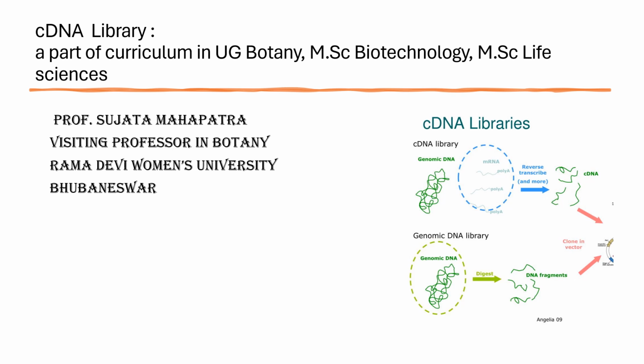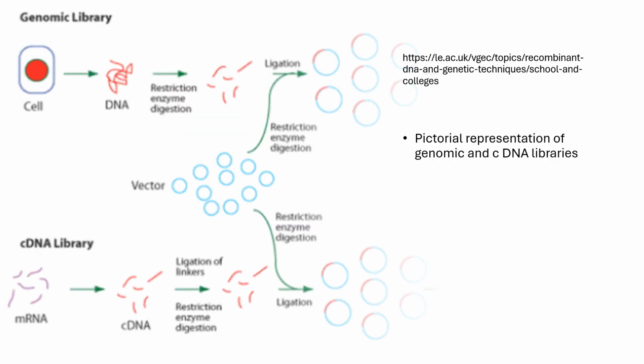We will be discussing the cDNA library, which is a part of the course curriculum of UG Botany, MSc Biotechnology and MSc Life Sciences. This is a pictorial representation of the difference between the preparation of a genomic library and a cDNA library.